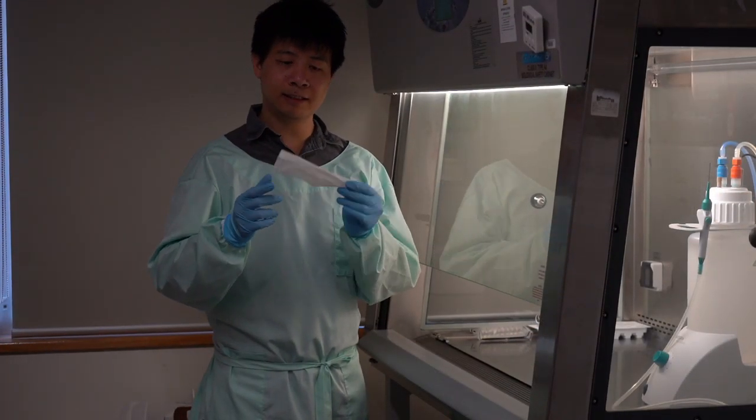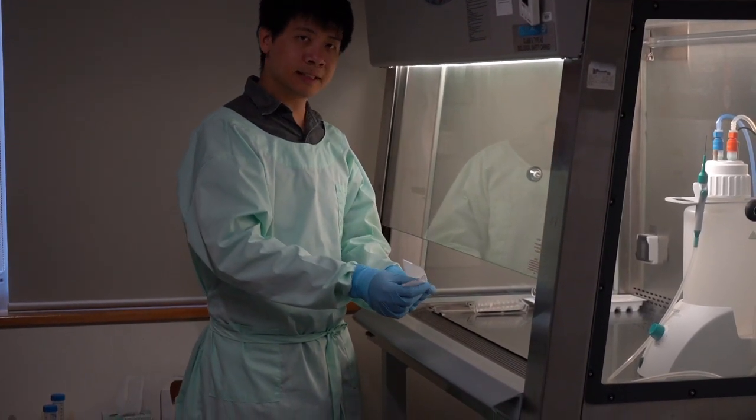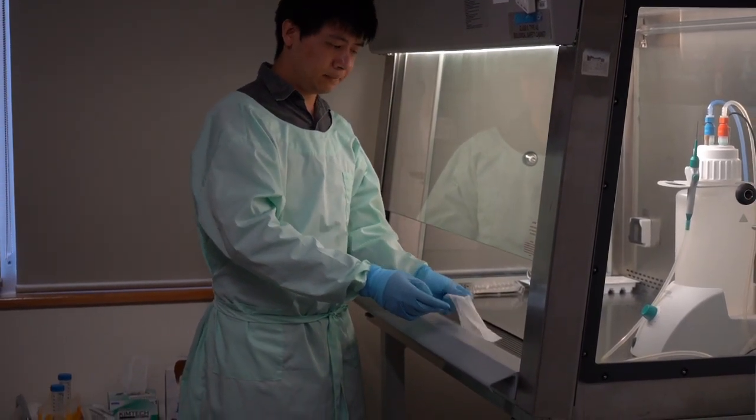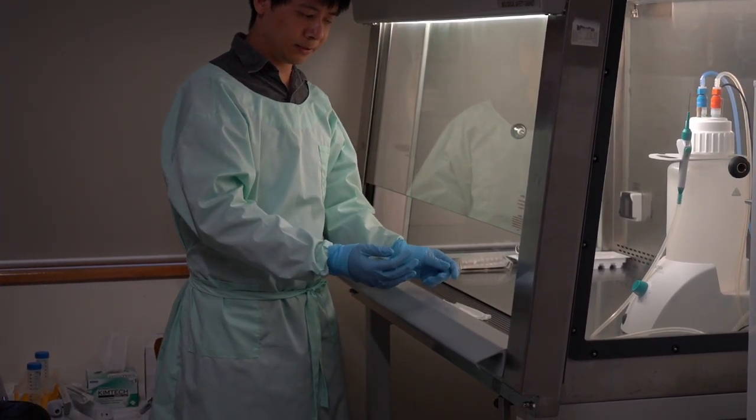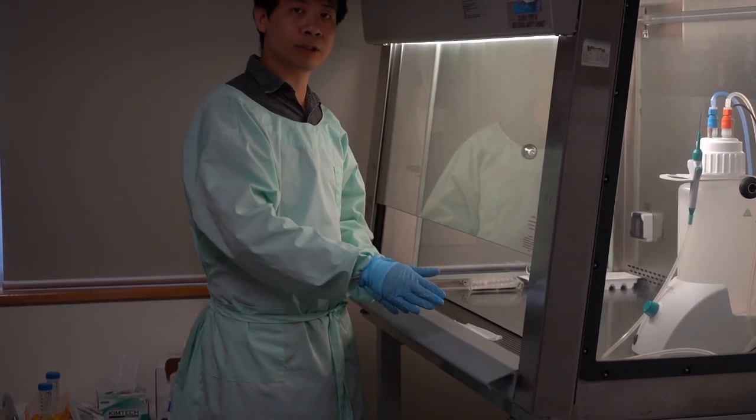To demonstrate this, I'll use a tissue paper and place it right at the front grill. As you can see, it immediately sticks onto the grill due to the suction of air from the outside into the grill.